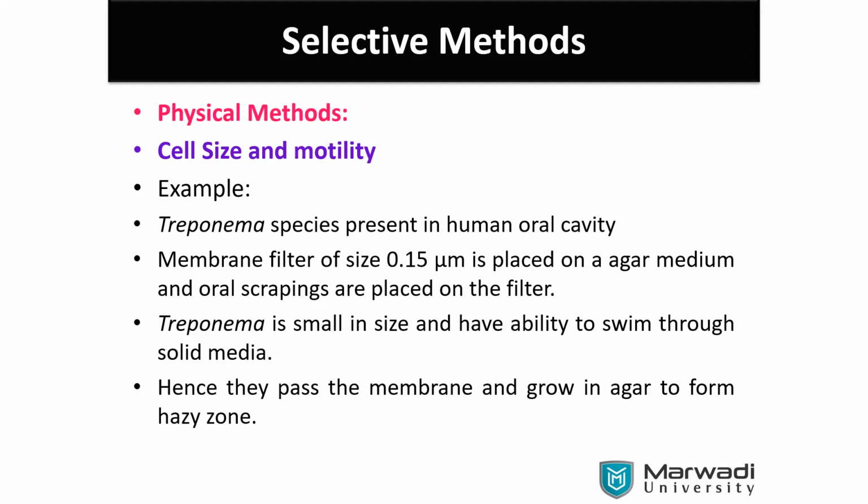If you are doing this with sperm collection and observation, the window period of observation should not be prolonged. If the sample is collected in the morning and you check it at night, the whole cells may be in a dead condition. The window period should be a minimum, then you can observe the cell motility.